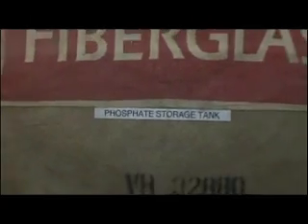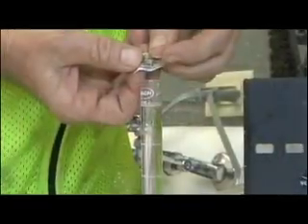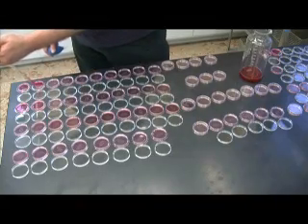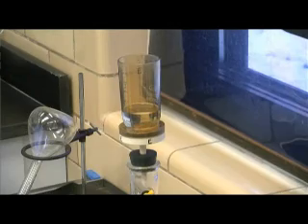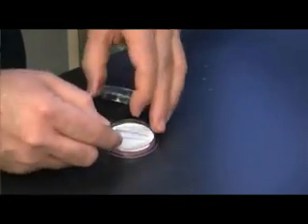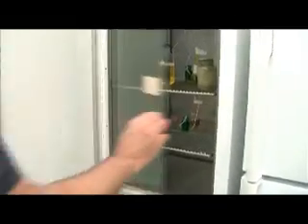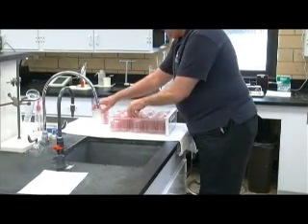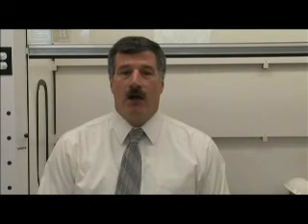The phosphate forms a thin coating on the inside of the lead and copper pipes used in buildings to prohibit the water from coming in contact with the metal materials, thus limiting the concentration of these metals in the water. The lab staff also performs microbiological monitoring using the membrane filter process. Microbiological monitoring is completed on samples from 4 different phases of the treatment process, twice per day. In addition, a minimum of 80 samples are collected from various locations throughout the city and analyzed to ensure that the water in the distribution system is safe.